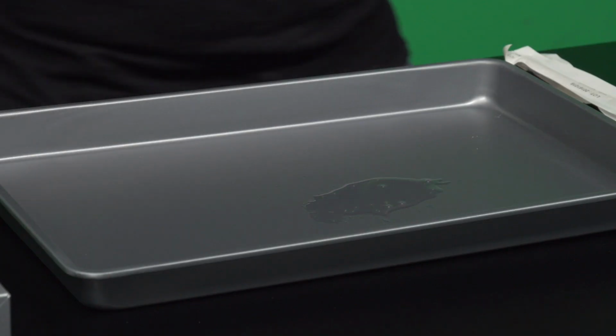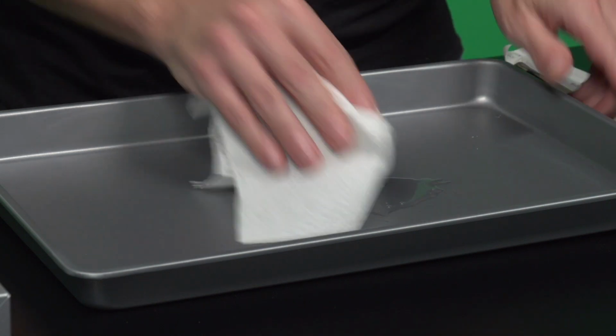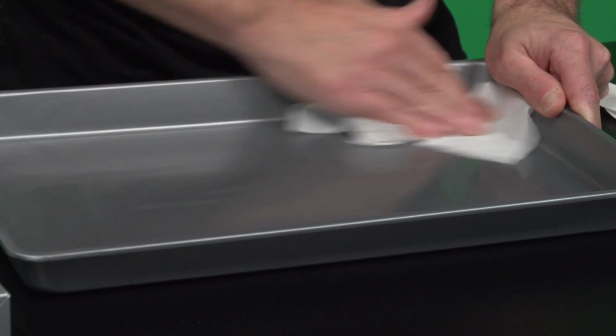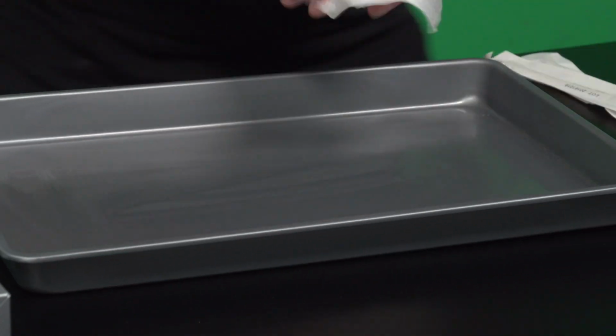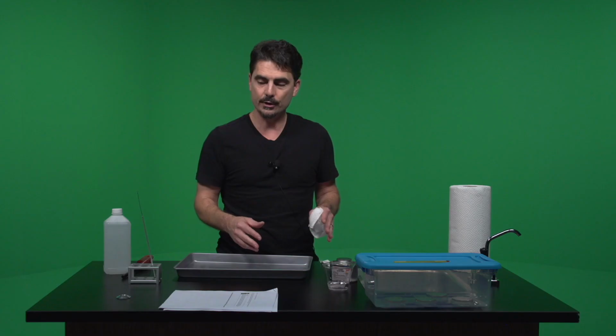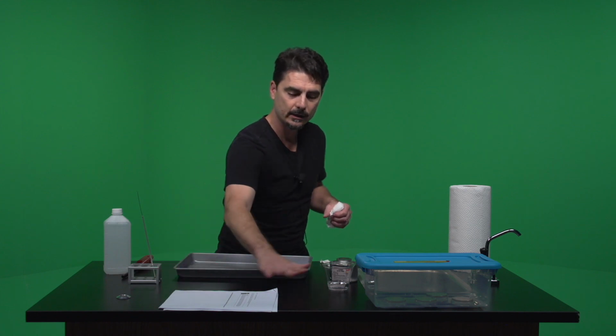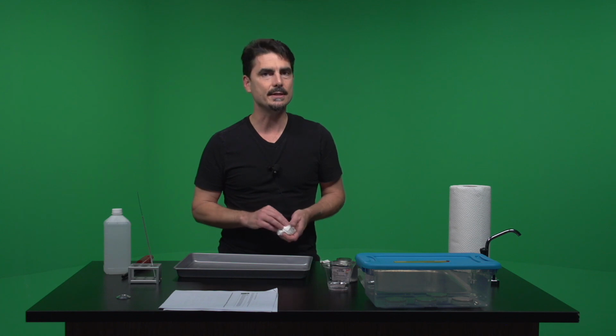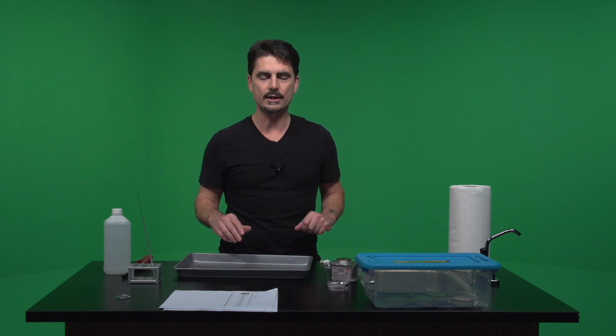So I'm just going to go ahead and just because I always like to make sure I clean up when I'm done, I'm going to go ahead and clean this up with isopropanol. And then after I accumulate everything and put it away, I'm going to go ahead and clean this whole surface all around here. You know, it might be your kitchen counter, it might be a table, wherever it is. Make sure that you clean it appropriately at the end every time.